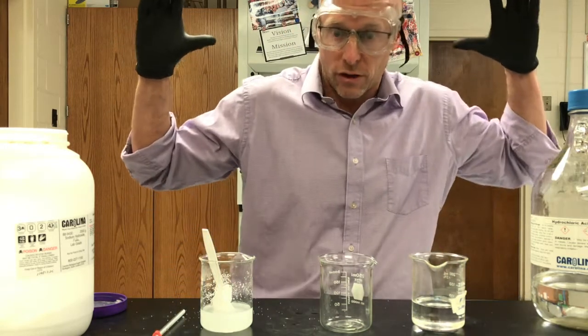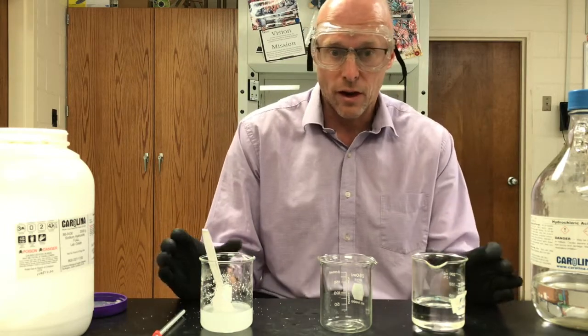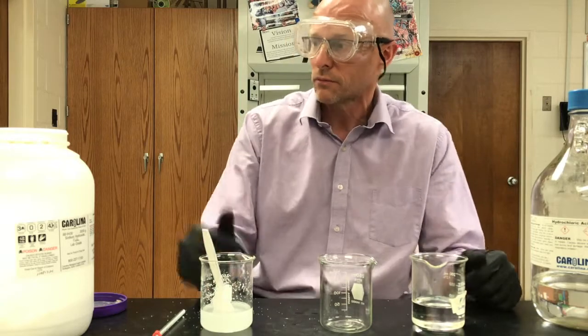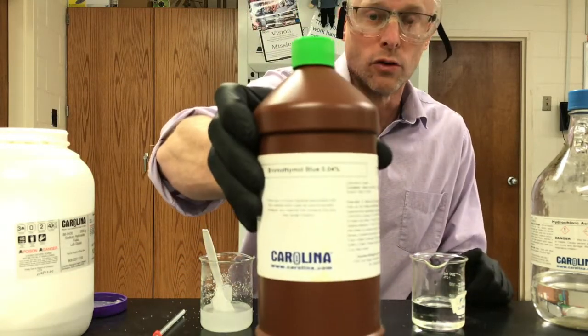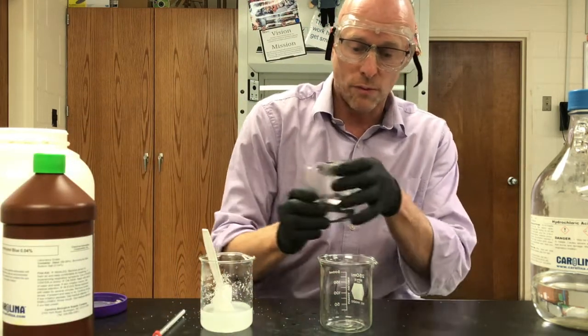They're both a strong acid and strong base, and also very concentrated. We are going to get them to neutralize each other — we're going to do a titration, a rough titration. I'm going to use bromothymol blue as my indicator and I'm going to start with my acid.